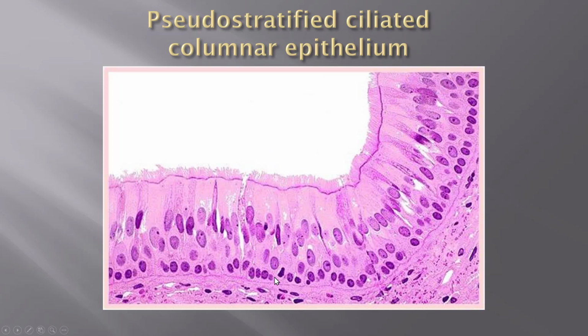We're going through this layer, and here's your change right here. This is your basement membrane. But, geez, I don't have a free edge here. I've got all these nuclei all over the place. And there's my little cilia. But if you remember what I said about the simple columnar epithelium, what I said was you could draw an imaginary line and you'd hit all the nuclei.